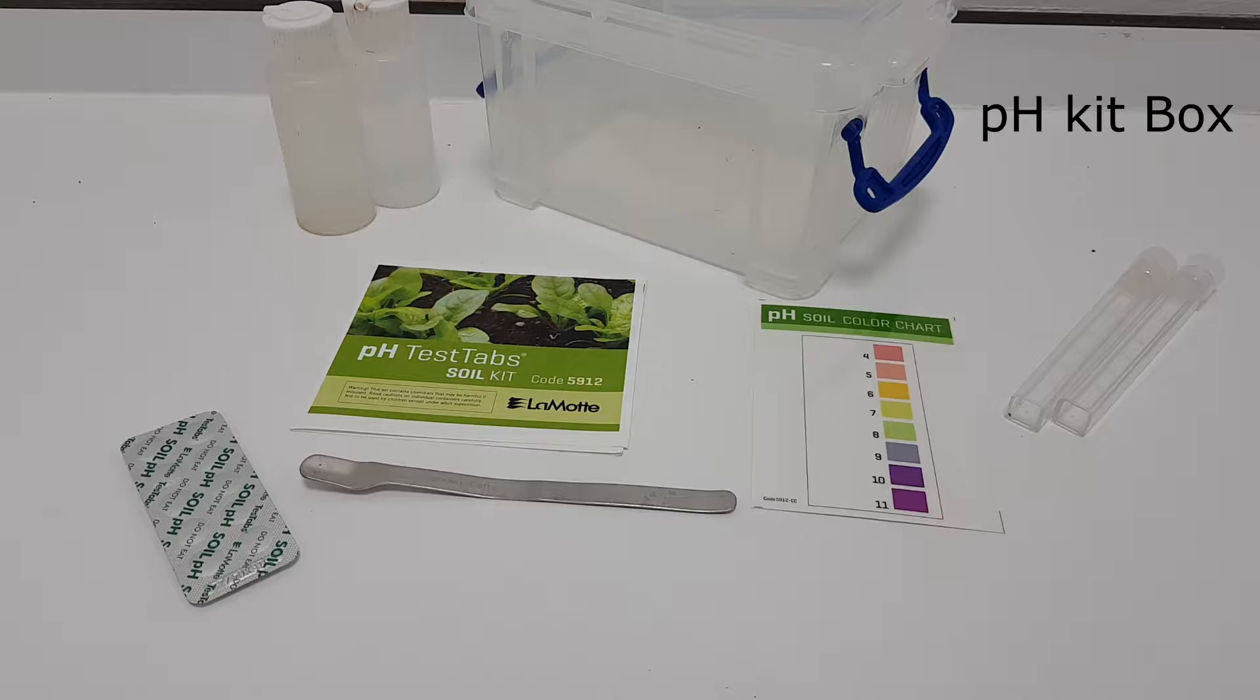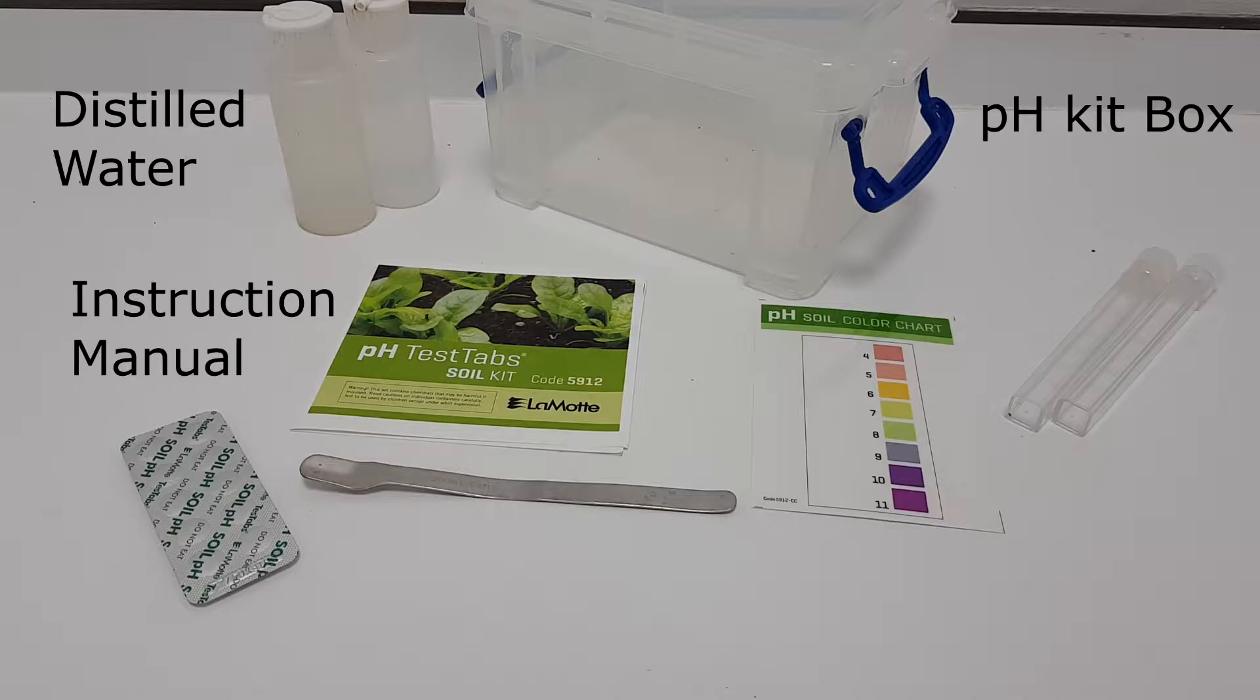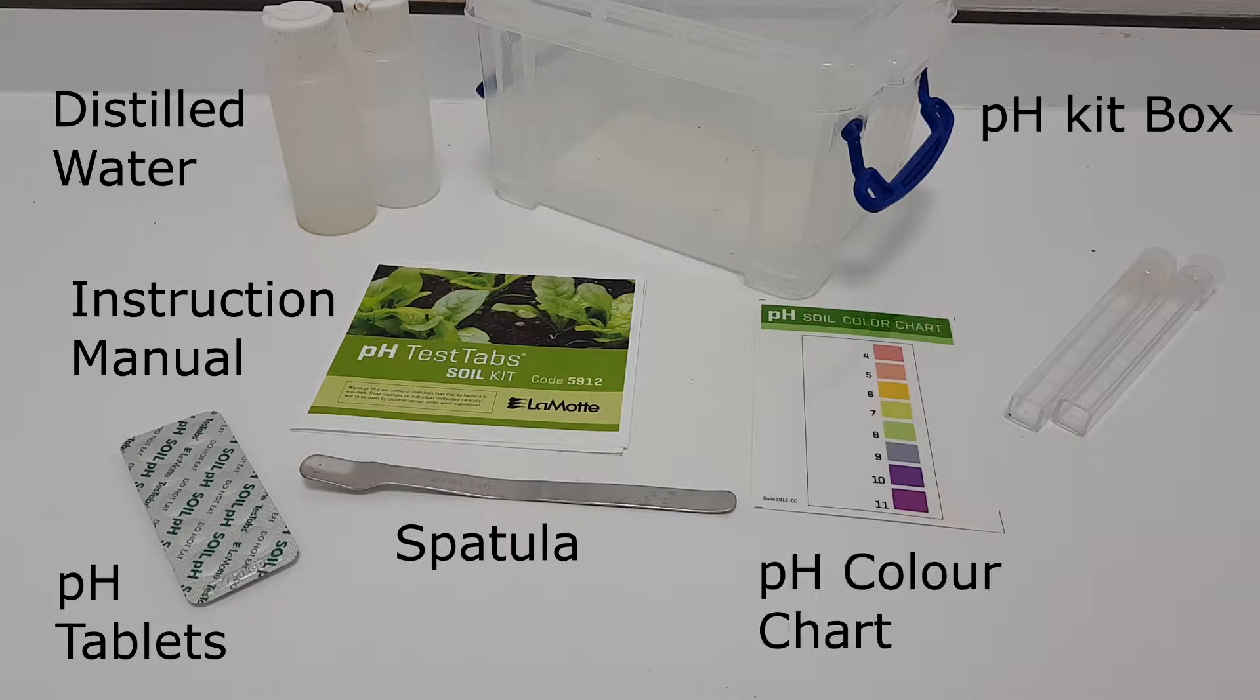Inside your kit box, you'll find some distilled water, the instruction manual, the pH test tablets, a spatula, the pH color chart, and some test tubes with caps.